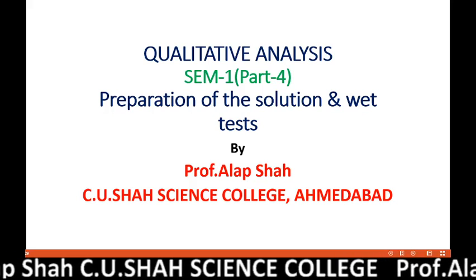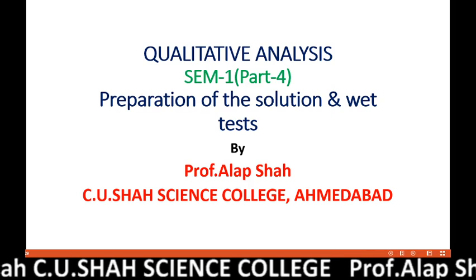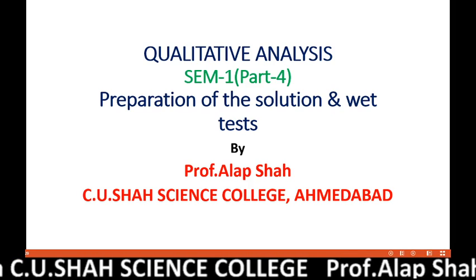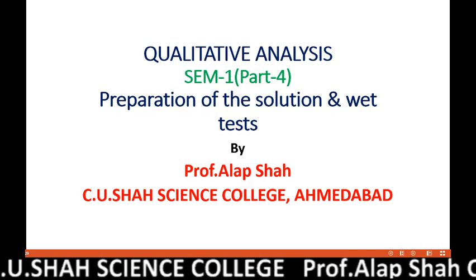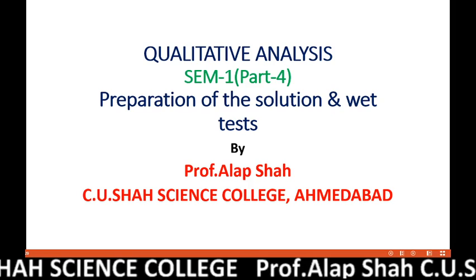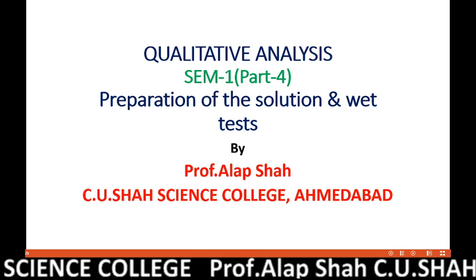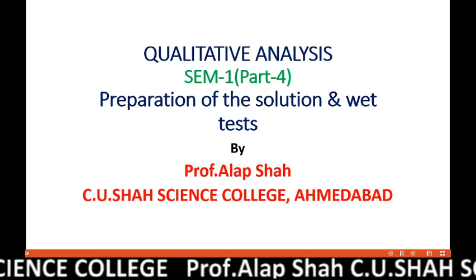Since the last three parts we have been discussing qualitative analysis in the practicals of semester 1, and we have discussed the primary test, the dry test of positive and the dry test of negative. That portion is new for you. You are not used to performing it in the 12th standard.